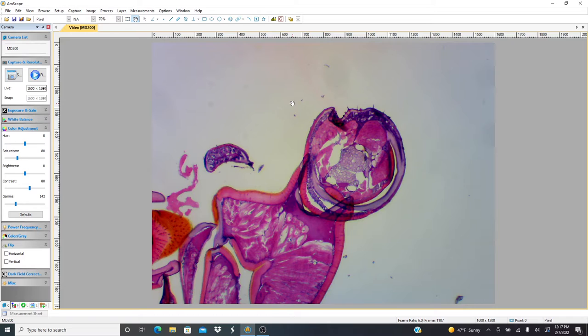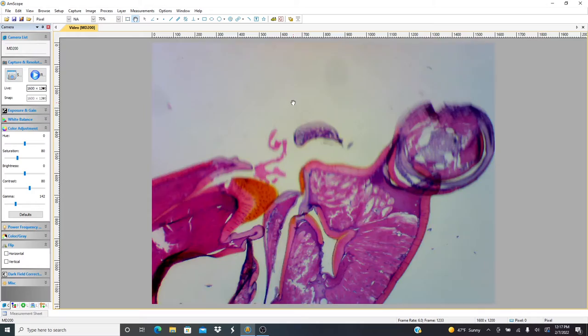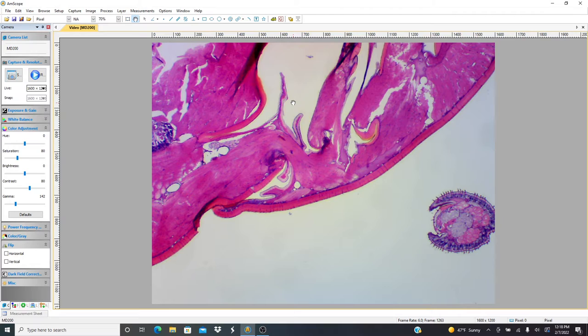Alrighty. So I'm gonna do another one here today. This one, I believe this is an insect. Well, I know it's an insect, but I believe this is some type of red centipede that my daughter found. Hard to cut histology on this because it's got this apparently chitin layer on the outside. You can see.